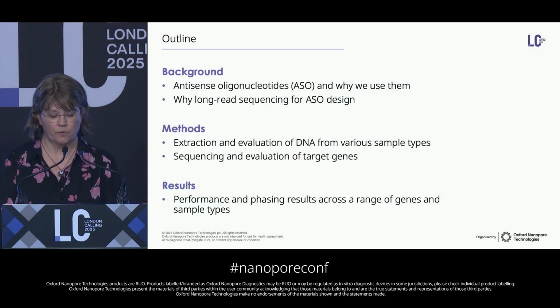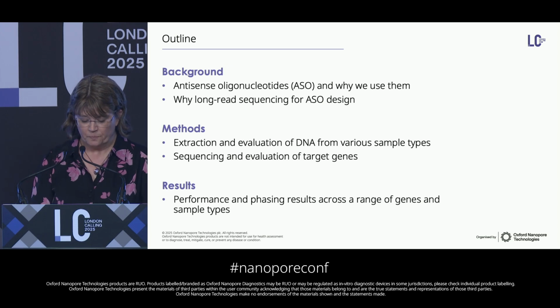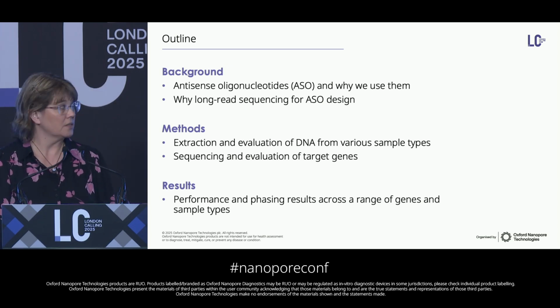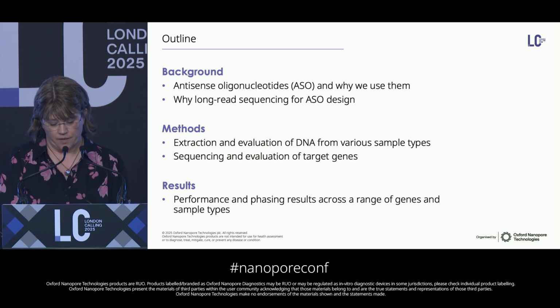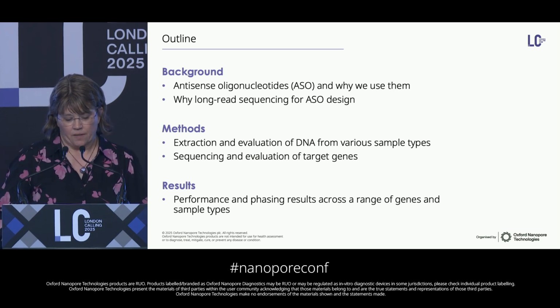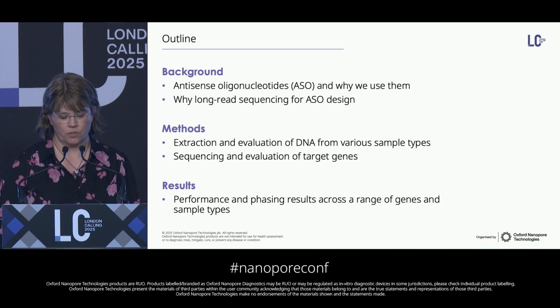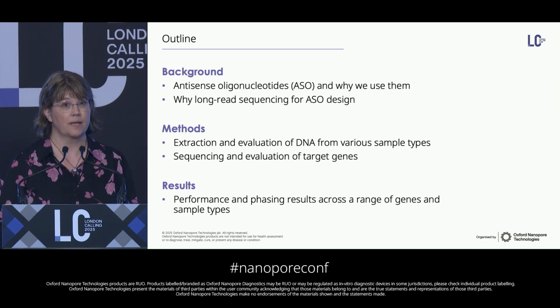Here's a quick overview of what I'll be talking about today. I'll start with a bit of background on ASOs, and then I'll discuss our methods, followed by some results showing how this approach performs across a range of genes and sample types.